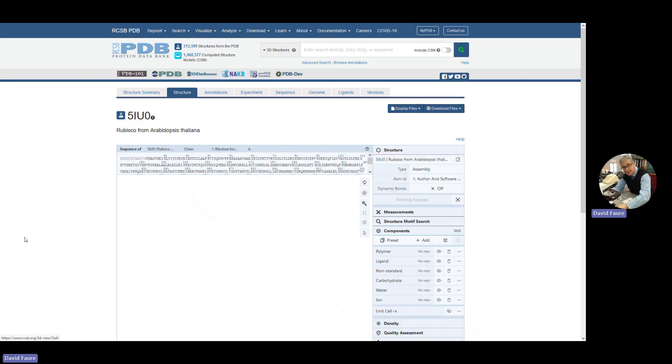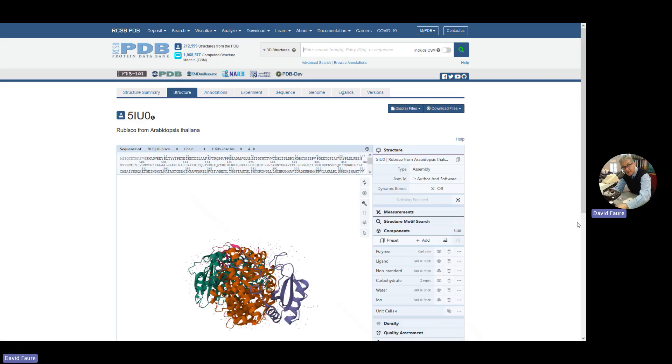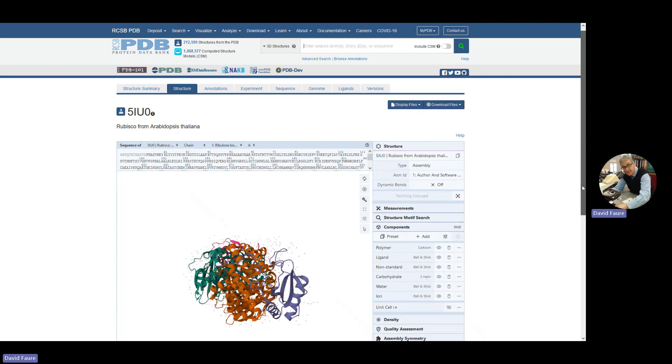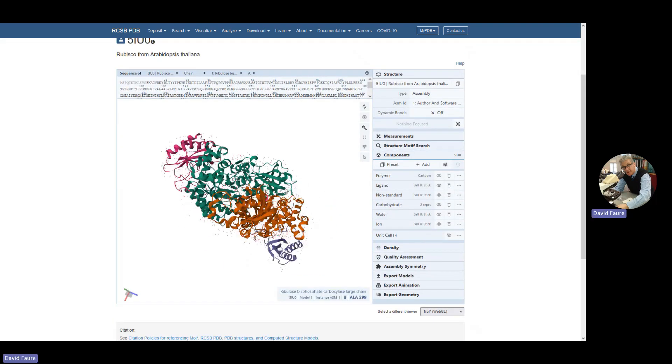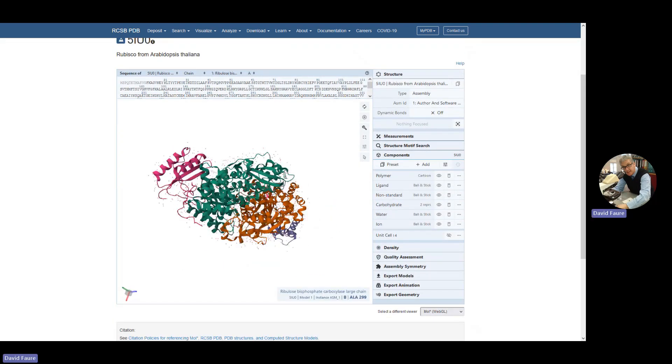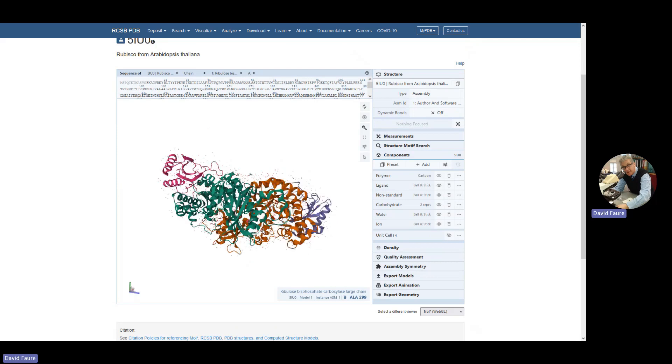And it will give you a three-dimensional view here. And what's really nice about this view, you can see the protein, you can move the protein around and have a look at the bits.